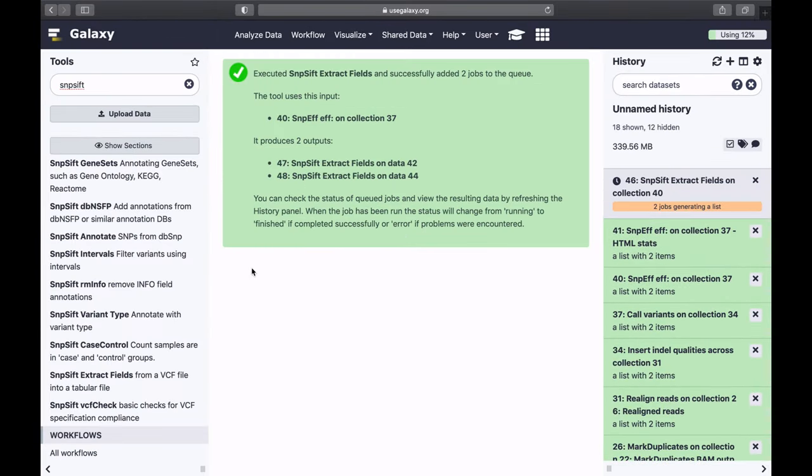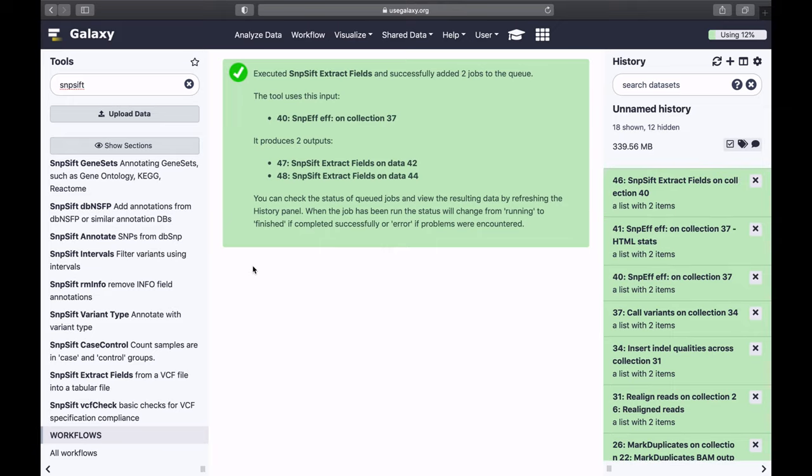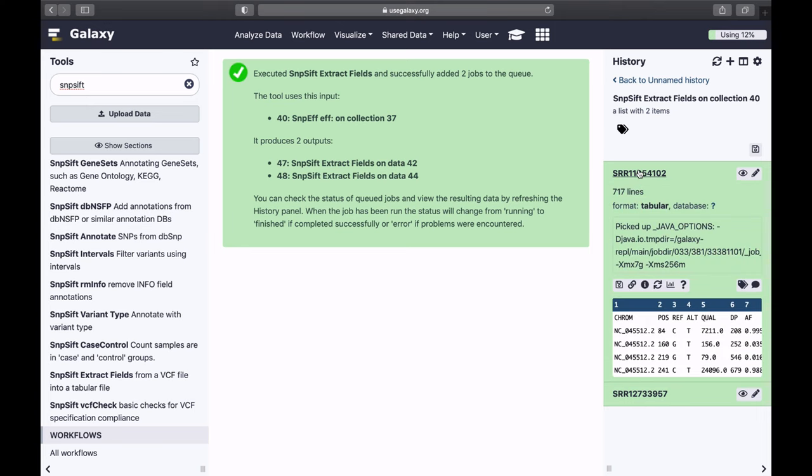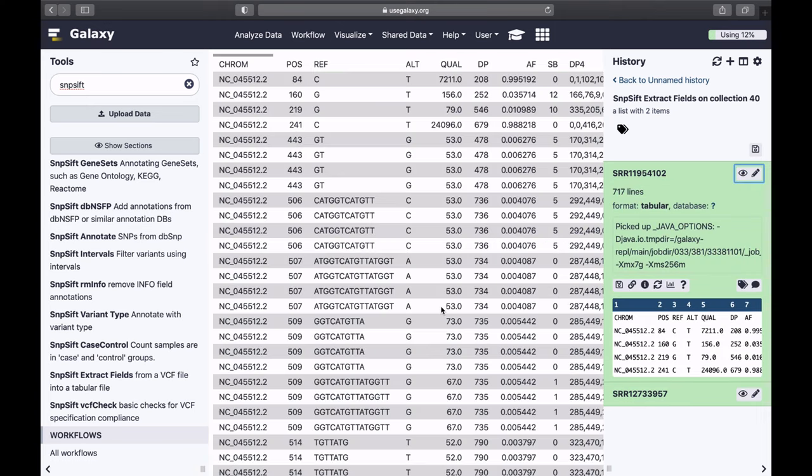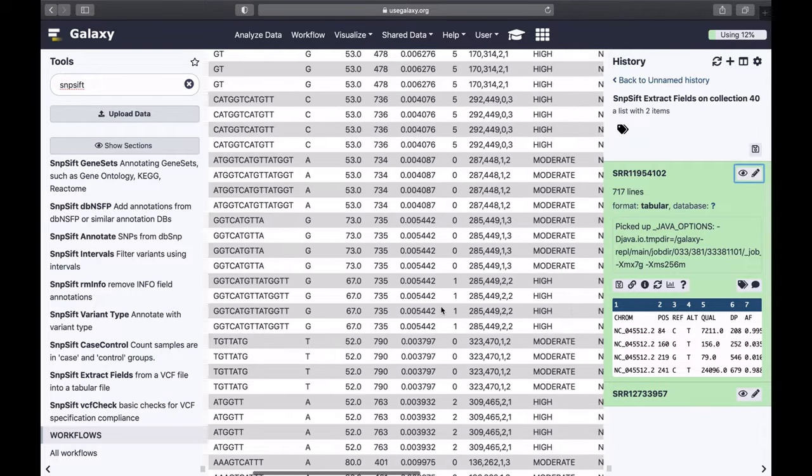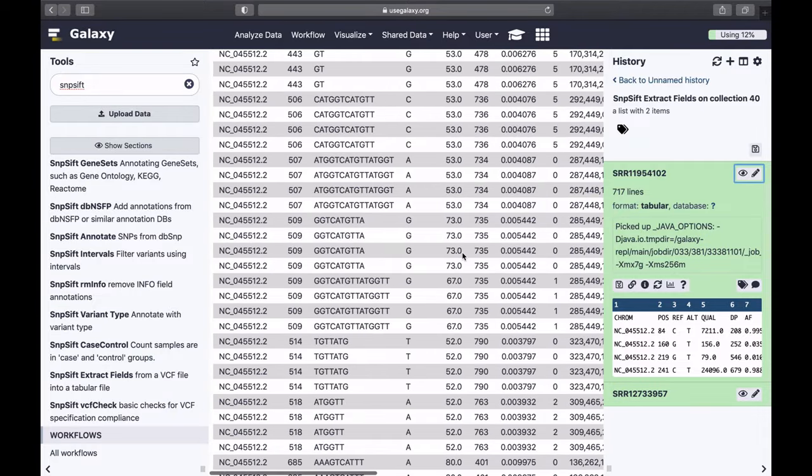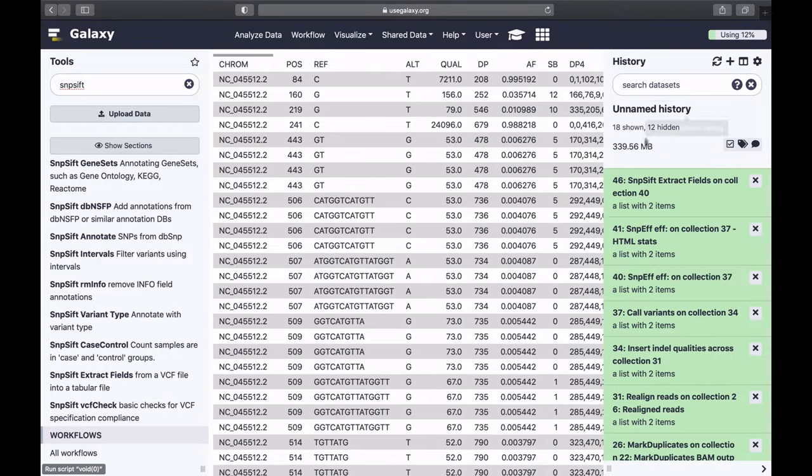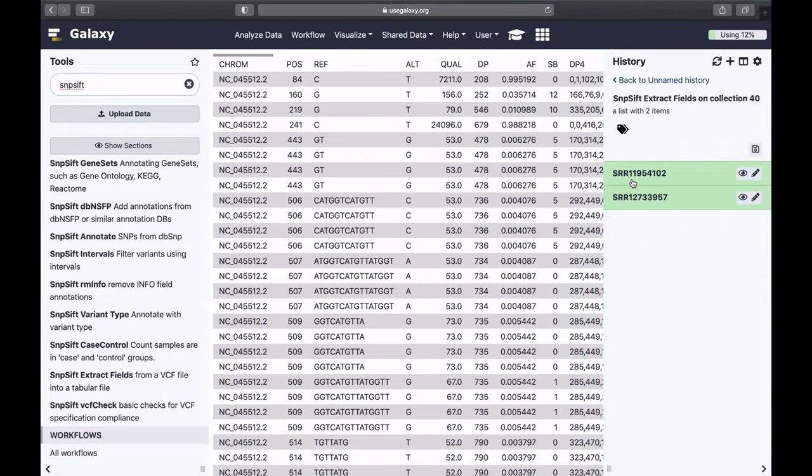You can see that at this point, these are simply tab-delimited data sets. So they're a little bit easier to work with. But it's still two data sets. What we would like to do is to combine all of this into a single one, which we can then use for the secondary analysis. For example, we can load this in Jupyter Notebooks or do anything we want with it.